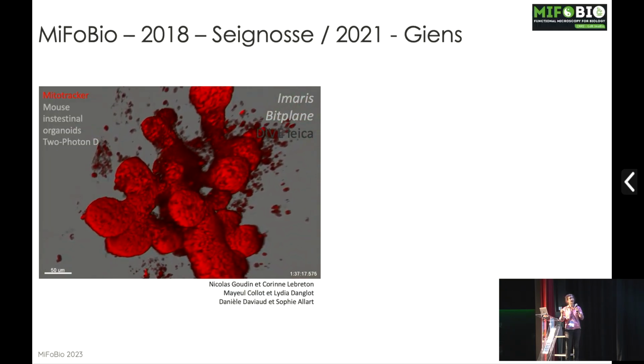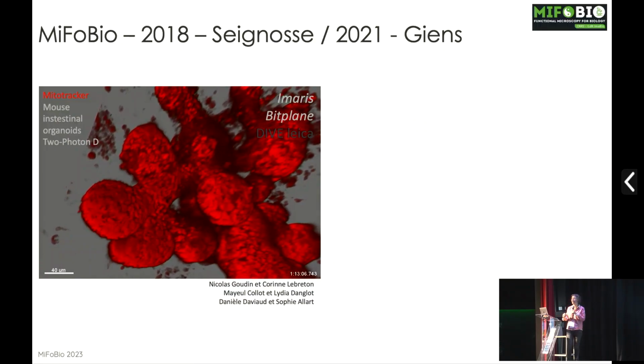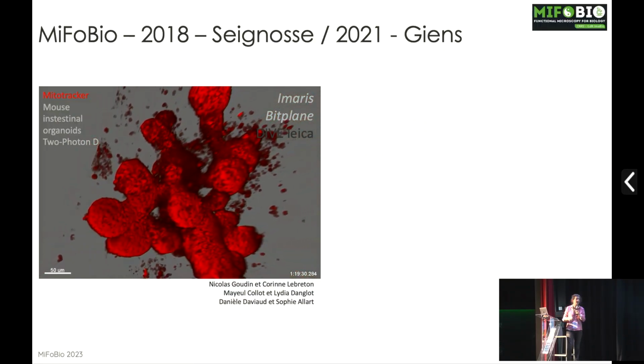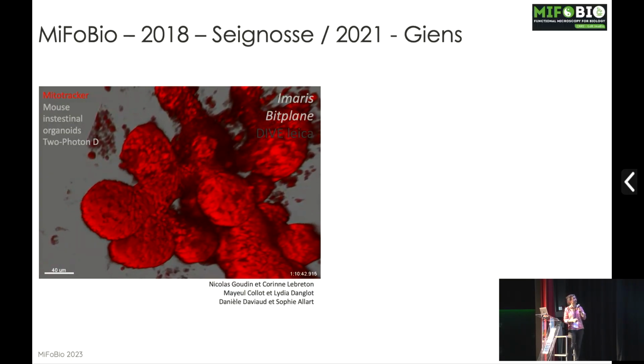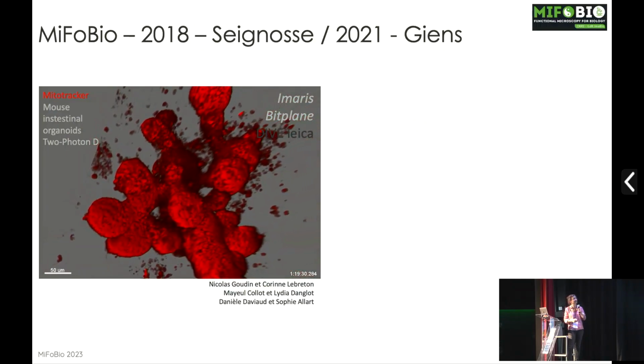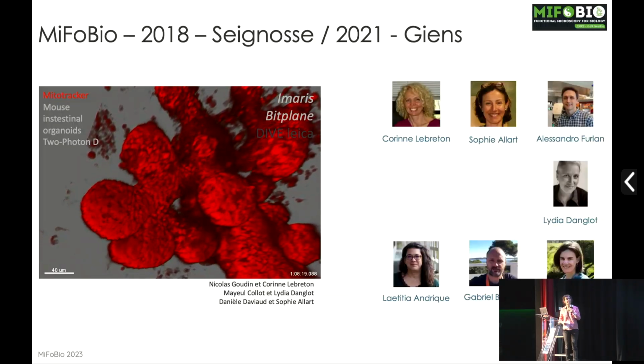Like the experiments we can do at Mifobio, you have the regular workshops, but then people gather, have ideas. I bring my sample, I bring my dye, I bring my knowledge in how to image the stuff. And here you have beautiful mouse intestinal organoids developing within the microscope.